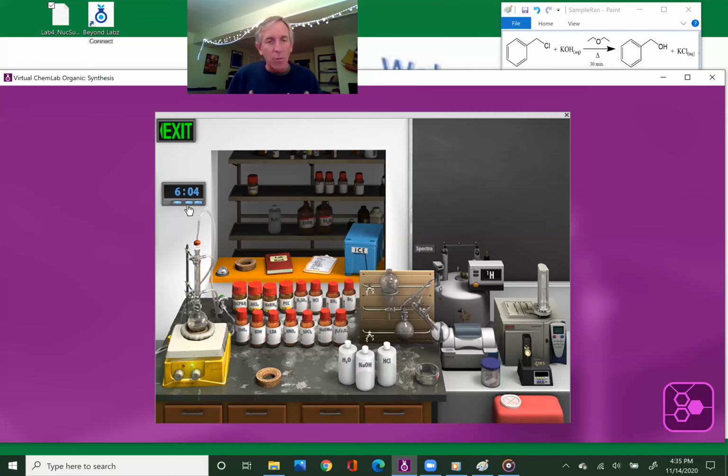Now, I want to work up the reaction. Essentially, isolate the organic product or products, the benzyl alcohol here, or any unreacted benzyl chloride, and get it away from all the aqueous things, like any leftover aqueous KOH or any potassium chloride salts that I've made that are swimming around in the water. So now I have organic and water swimming here, and whenever you have organic and water swimming in the same pot, you do what's called an extraction. And extractions require the use of separatory funnels.